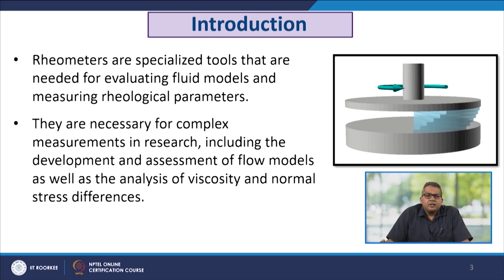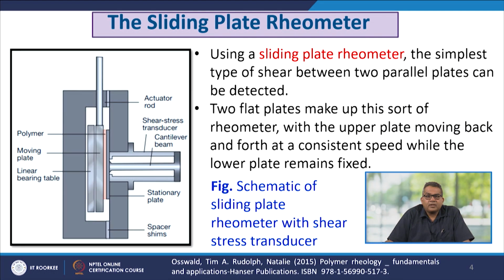Usually, they are necessary for complex measurements in research, including the development and assessment of various flow models, as well as the analysis of viscosity and normal stress differences. There are different types of rheometers available as of date, based on the uses, based on the fluid used, based on various other approaches.